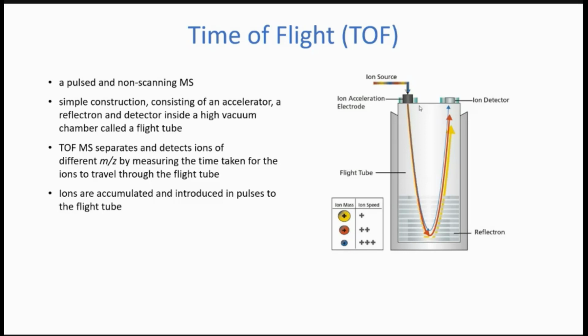the starting pistol fires. Your pusher is your starting pistol, and you want to make sure all your ions start moving through the flight tube at the exact same time. That's probably the most important thing to get right with one of these, because that determines the time at which it's going to hit the detector.